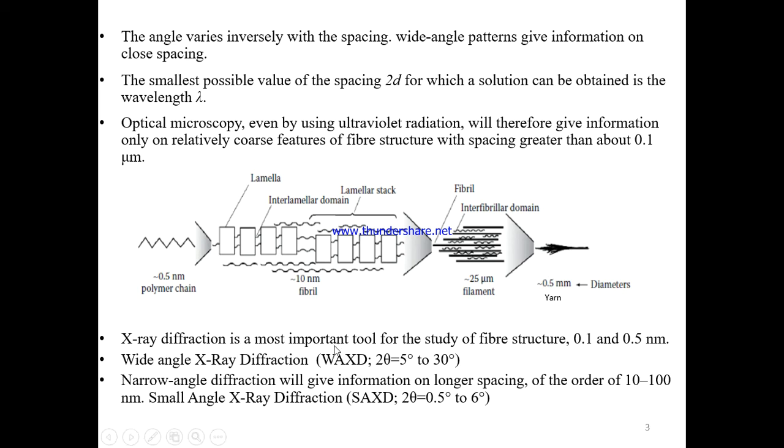X-ray diffraction is the most important tool for the study of fiber structure, with dimensions of 0.1 to 0.5 nanometer. Now you are coming into the nanometer zone.